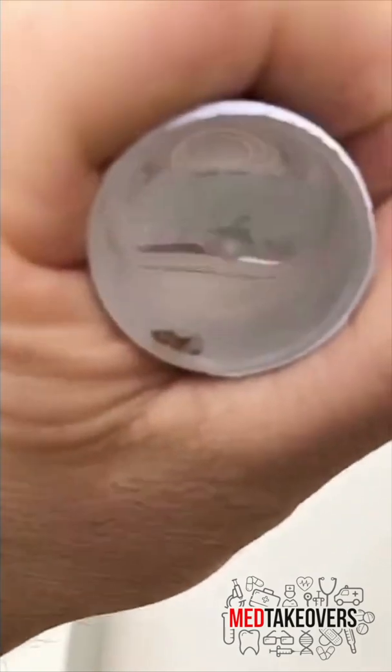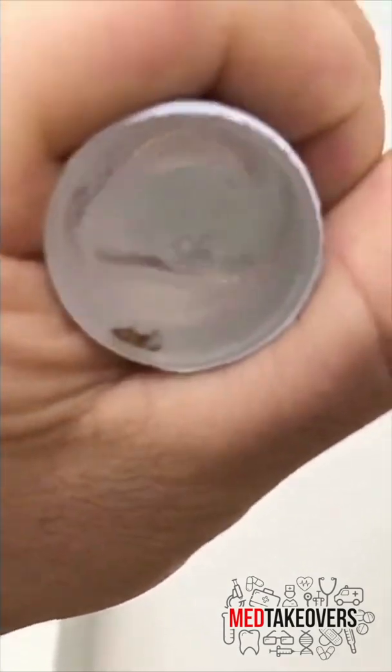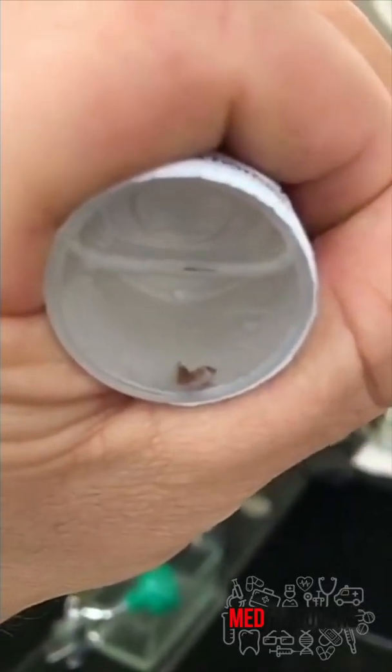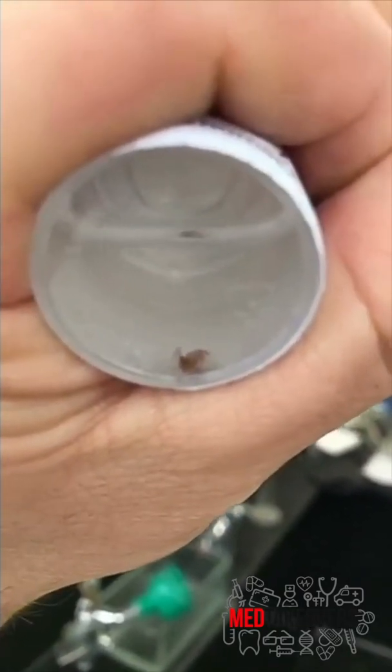Formalin fixes the tissue — it keeps it from breaking down, rotting, or the cells from falling apart. It links the proteins together in the tissue and keeps them from denaturing or breaking down. This is important so we can see what the cells look like and do stains to identify them.